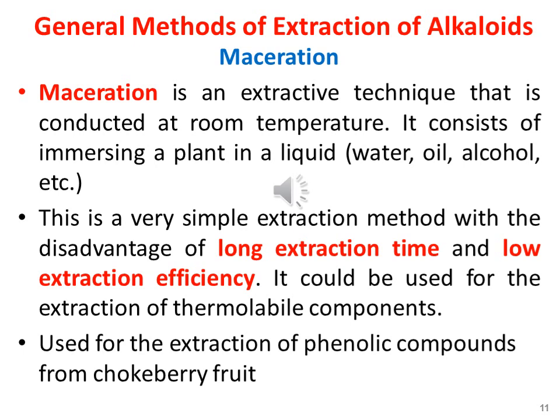Maceration is a type of solvent extraction. It is an extractive technique that is conducted at room temperature. It consists of immersing a plant material in a liquid such as water, oil, alcohol, etc. This is a very simple extraction method with the disadvantage of long extraction time and low extraction efficiency. It could be used for the extraction of thermolabile components. However, it has the disadvantages of long extraction time and low extraction efficiency. This method has been used mostly for the extraction of phenolic compounds from the chokeberry fruit.